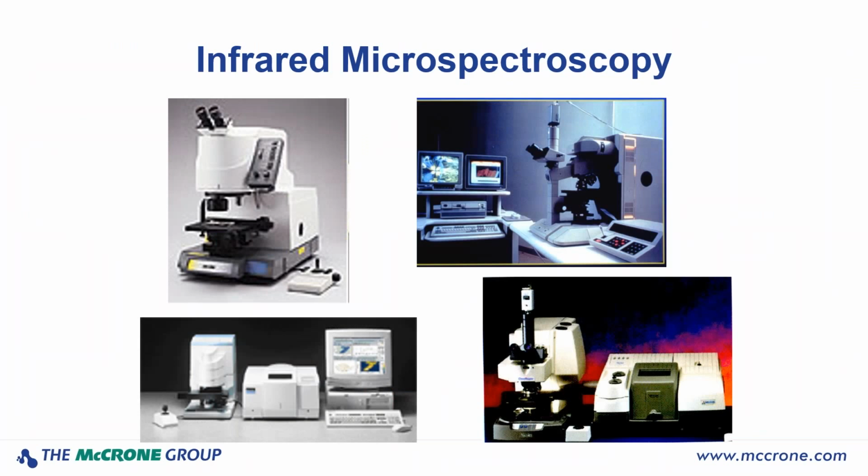One of the strengths of infrared is that it can be applied to microscopic sized samples. Using an infrared spectrometer with a microscope accessory, isolated particles as small as 20 microns can be analyzed while still maintaining good spatial resolution and low noise.